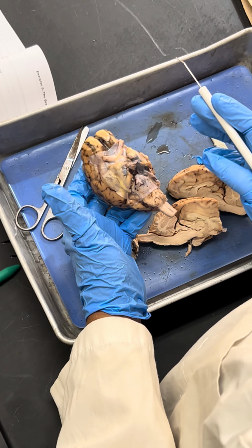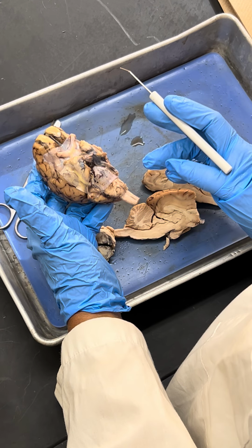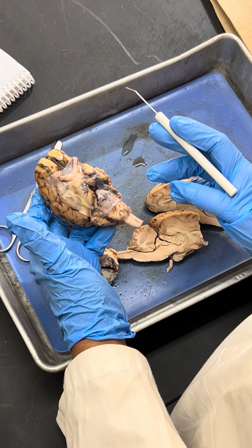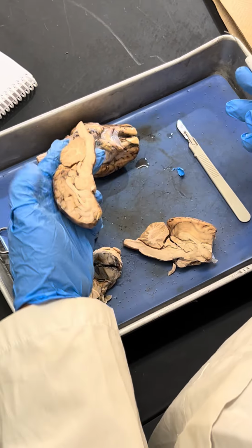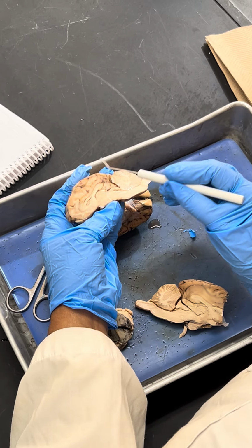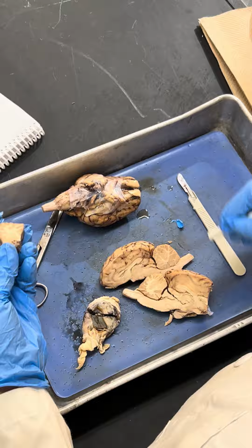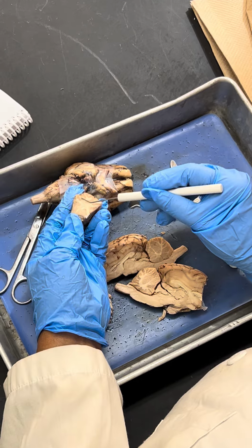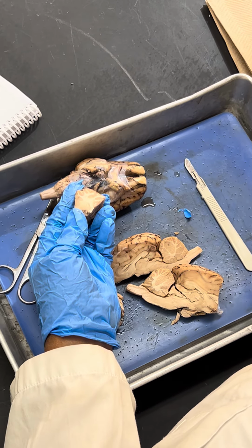That's all. Did I miss anything here? Gyri, sulci, fissure. I think I covered most of them. Oh, now inside. If you cut it in half, this is the half. Okay. In the half, first of all, let me show you. I cut it, and can you see the darker outer portion? This is the cerebral cortex.